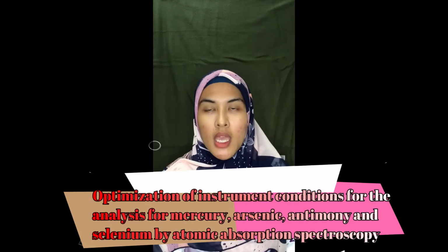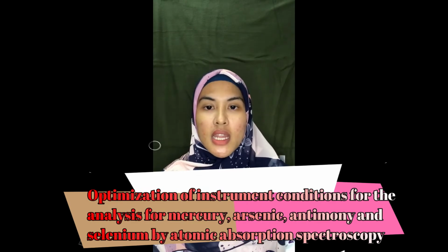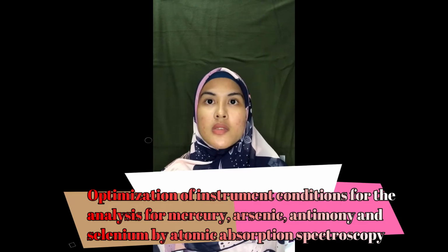Today, I want to talk a little bit based on my reading from the Journal of Optimization of Instrument Condition for the analysis for the mercury, arsenic, antimony and selenium by atomic absorption spectroscopy.